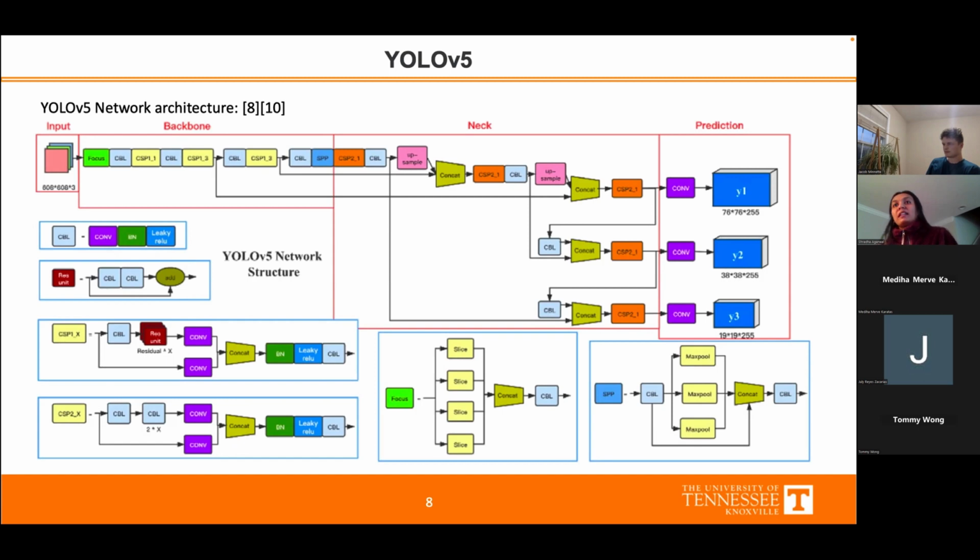So this is what is happening with the YOLO head. As you see, it is 19 into 19, 38 into 38, 76 into 76. So these are how different objects of different aspect ratio can be processed. The smaller head, Y3, you see that resolution is poor, but Y1 is a big head, resolution is huge. That means in an image, if it consists of a car in front versus a car in the background, any traffic image, right? Where you just take an image of traffic, the cars at the back appear to be small versus the car at the front, they appear to be big, right? Yep. So it takes into account all the things together.